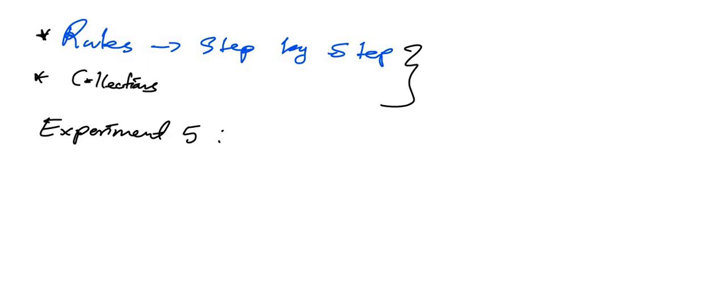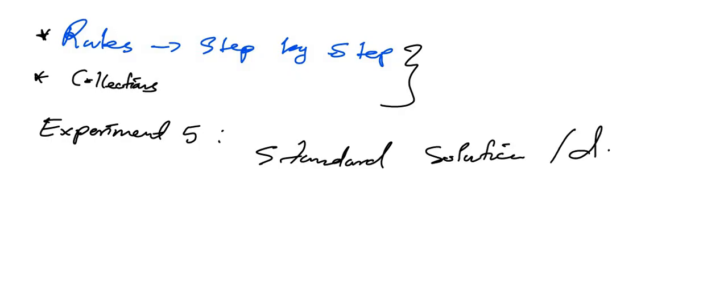You collect them from that side, and then you make necessary dilutions to have enough so that you can repeat your titrations to get a certain number of trials for you to get a mean titer. Yeah, so when you get your standard solutions, they may ask how to make a primary standard solution. We'll look at the questions later on from the samples I provided. So you need to collect your standard solution from the technician, then you dilute them using your distilled water to make up to some volume. Mostly it's 250 mL, depends on the beaker that you're going to be using.